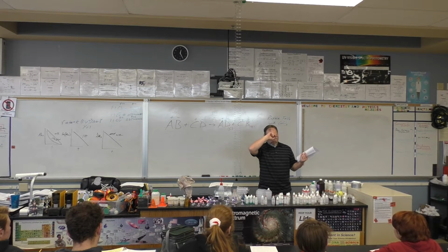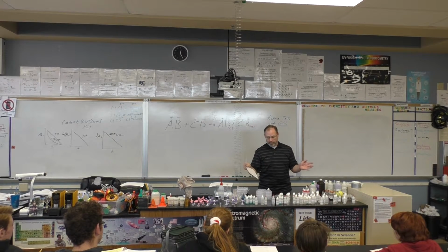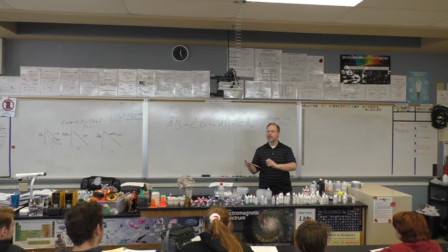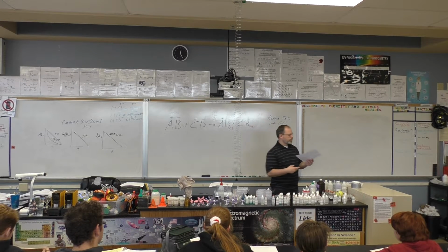Unfortunately, this isn't really third period's fault because second period got them all mixed up and I kind of gave them to them in a messy way. They're all over the place, but they're all up here. So what I recommend you doing, not right now, but in a second, is grab like 2 or 3 just so you can do a certain number of combinations. Then when you're done, bring them back.